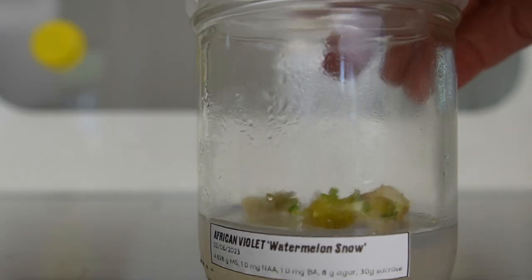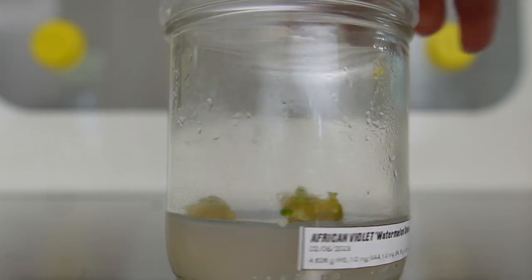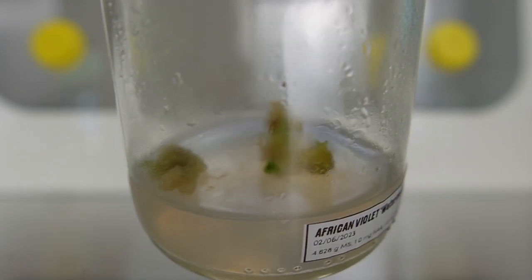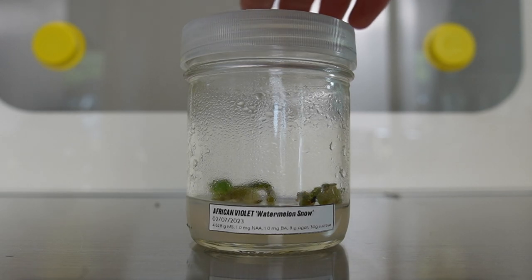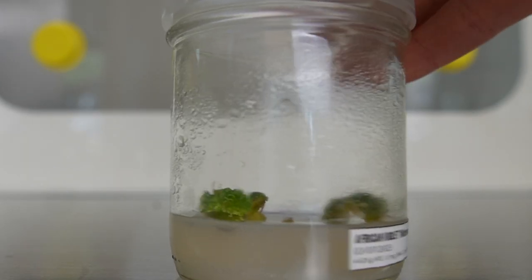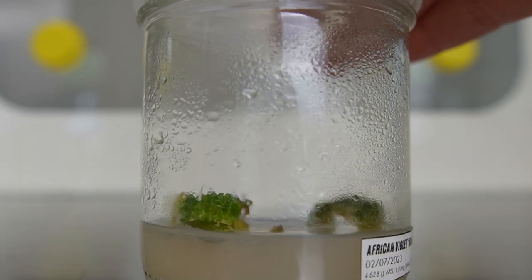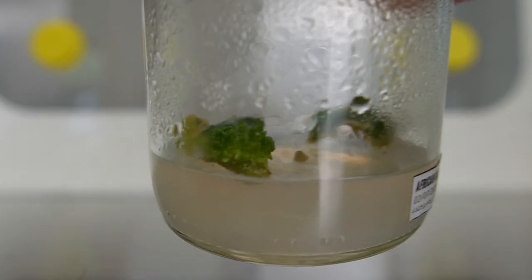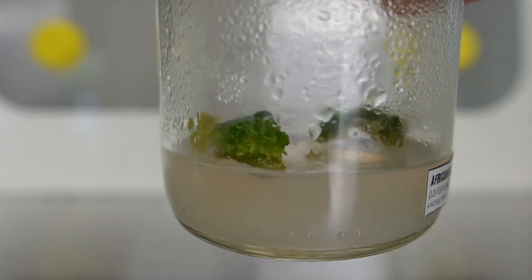The African violet watermelon snows are doing amazing. I did have some jars where the leaves just died, and I got rid of a few jars because I had so many and didn't want to end up with a billion African violets — half a billion is enough. You can actually see there are baby plants growing in these jars. They are so adorable; you can see their little tiny leaves forming. I can't see any variegation on the leaves yet. African violet watermelon snow is a variegated violet, but we have plenty of callus forming. These jars look incredible.